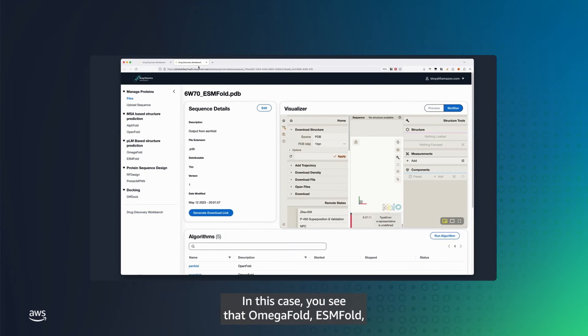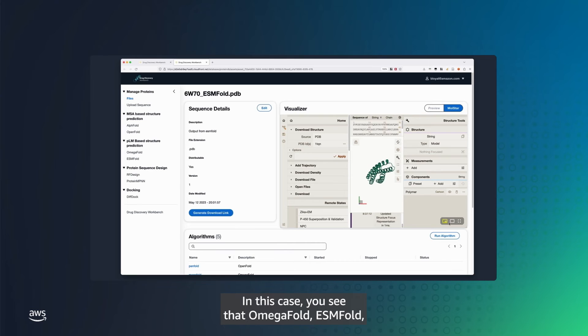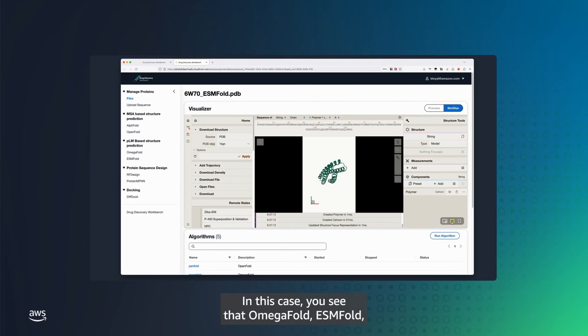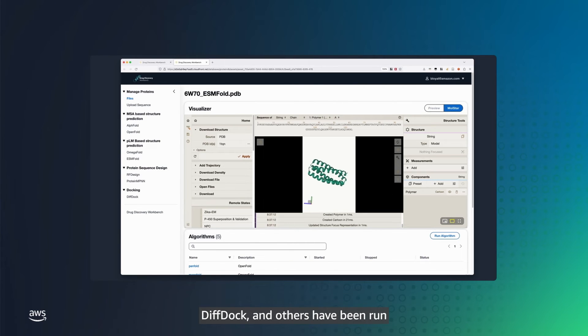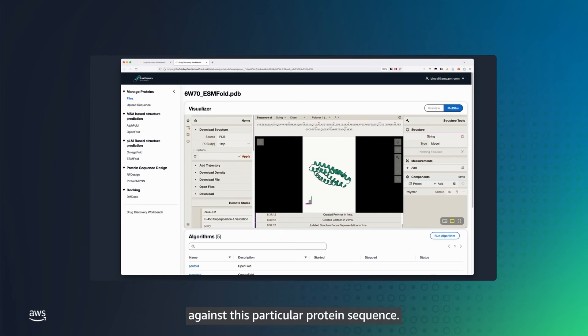In this case, you see that OmegaFold, ESMFold, DiffDoc, and others have been run against this particular protein sequence.